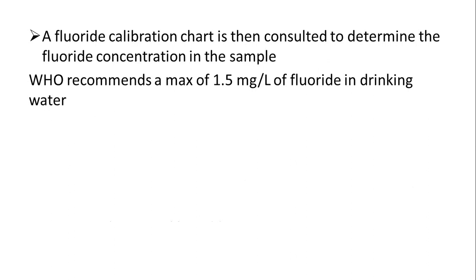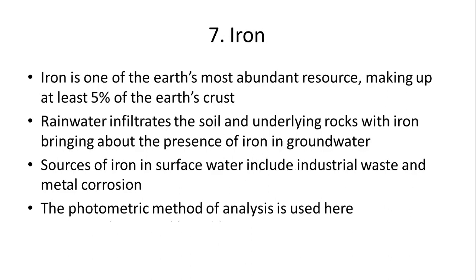Kenya recommends generally less than 1.5. Yeah. So next, iron. We'll look at iron.